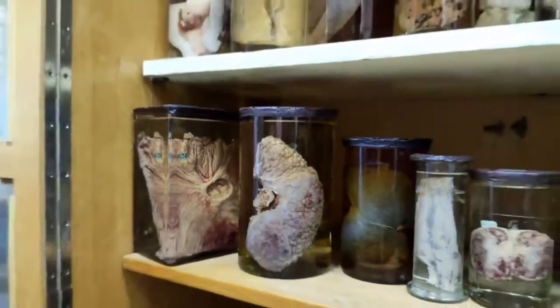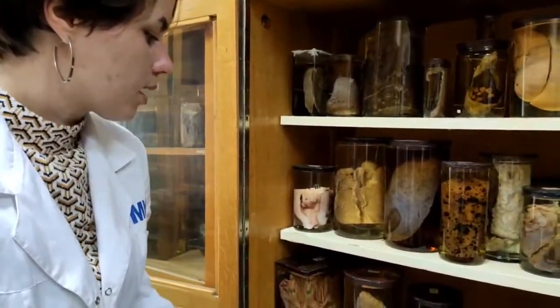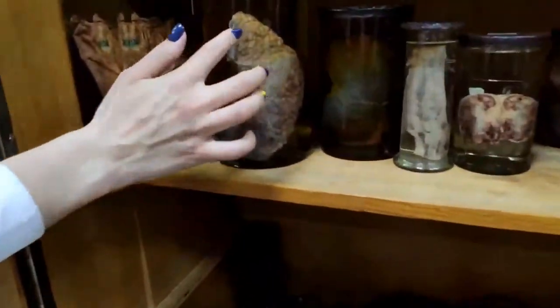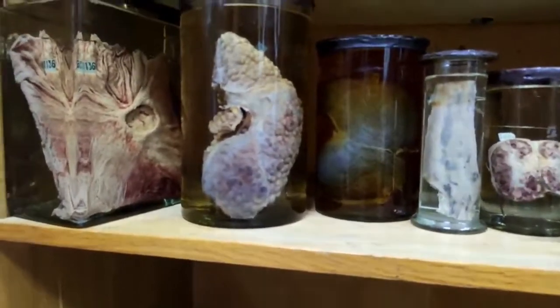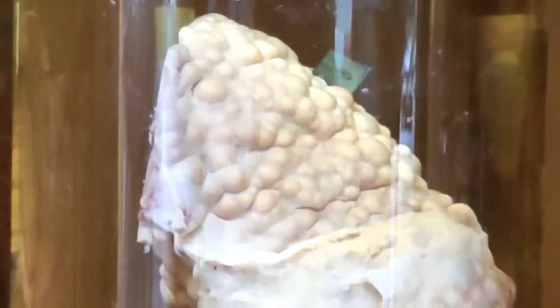Cirrhosis is a transformation of normal liver architecture into abnormal lobules, so abnormal nodules, which we can also call regenerative nodules. That means that islands of hepatocytes are surrounded by fibrotic tissue. Firstly, we have fibrosis in the liver, and cirrhosis is the end stage of fibrosis in the liver.